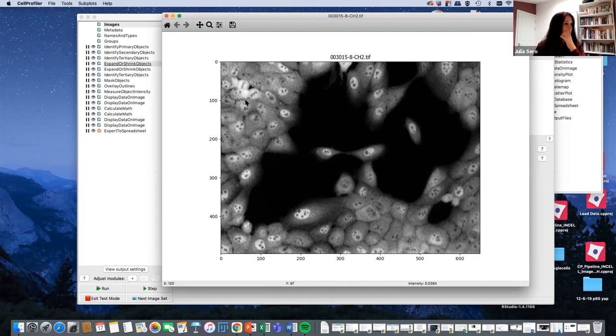When cells are all nicely columnar epithelia and they're all exactly the same height right up against each other, then the thickness of the cells is going to be pretty uniform across the whole range of the cell. That thickness is going to be consistent between the region where the nucleus is sitting and the region where the cytoplasm is sitting. Now, if we have cells which are more shaped like a sombrero, then the part where the nucleus is going to be a lot fatter than the parts out towards the edge of the cell.